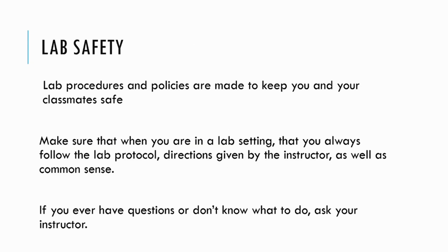Moving on from microscope work, we get into lab safety. Again, we're going to be at home. That's the safest thing that we can do right now. However, in future classes, lab safety is paramount. The procedures and policies in your lab classes are made to keep you and your classmates safe. So when you're in a lab setting, make sure you're always following your lab protocol, any directions that your instructor gives you, as well as common sense. If something doesn't seem safe, don't do it, or at least ask.